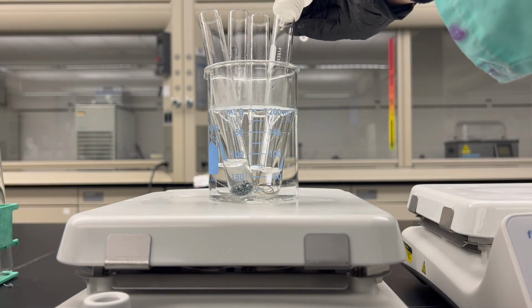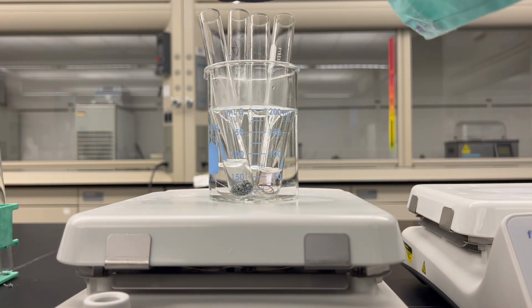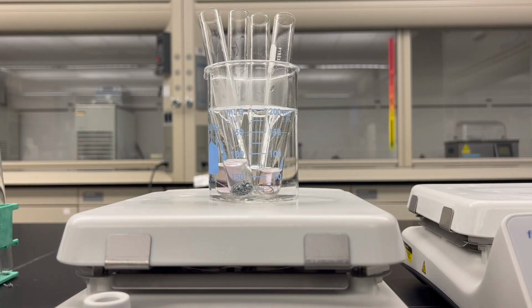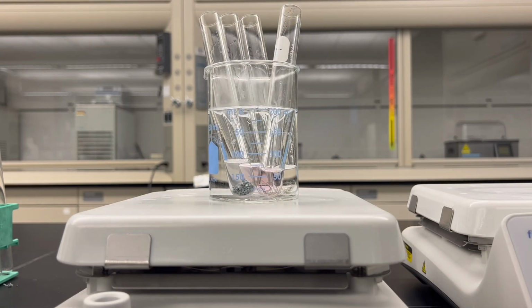And what I'm going to do is add a little bit of phenolphthalein to each of them so it can indicate when a reaction is happening. We already see one turning a little bit pink. It looks like to be the magnesium back here. So let's take a little bit of time, let these react and see what happens.